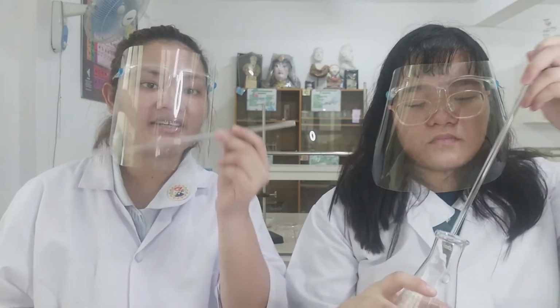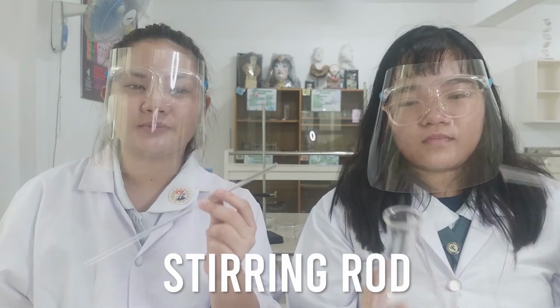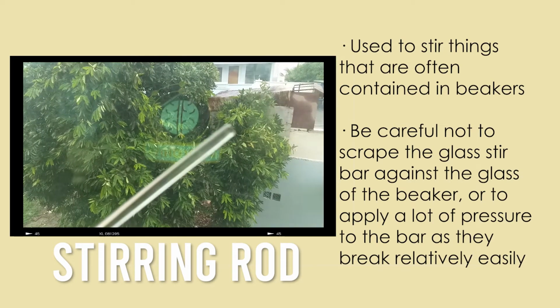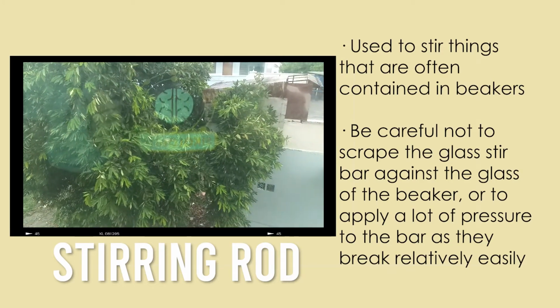Of course, whenever handling chemicals, you need to stir things. Good thing that there is a stirring rod for us not to endanger ourselves with the chemicals. But be careful when you're using it. Be careful not to scrape the glass stirring rod against the glass of the beaker or to apply a lot of pressure to the rod, as they break relatively easily.